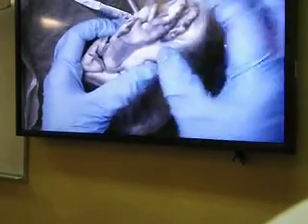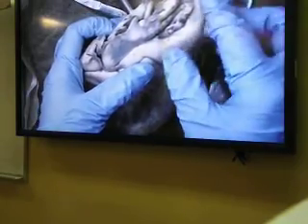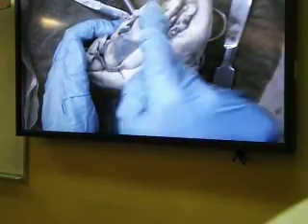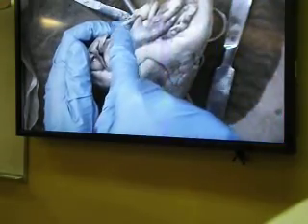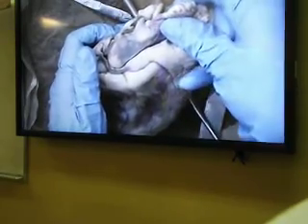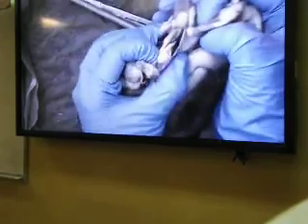And so if the superior and inferior vena cava are present, they have to be very close to the right atrium, and wherever the hole for the superior and inferior vena cava is, if I push my finger or probe, it will end up inside this chamber. So very close to the right atrium. Can I see any hole?